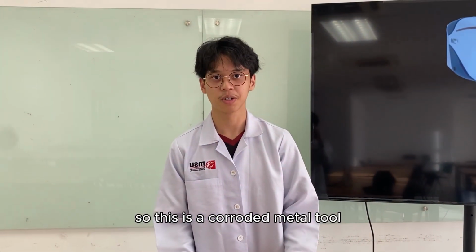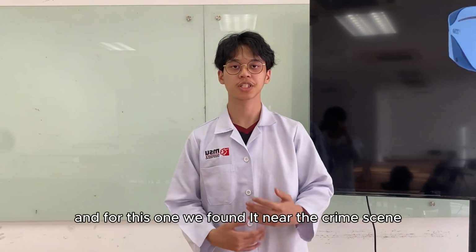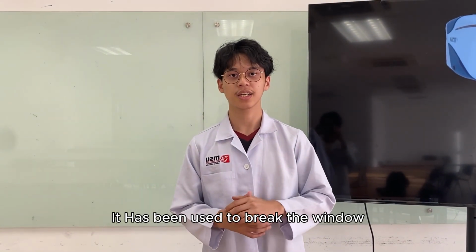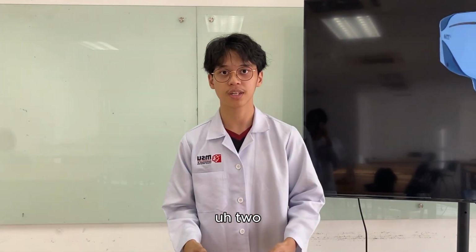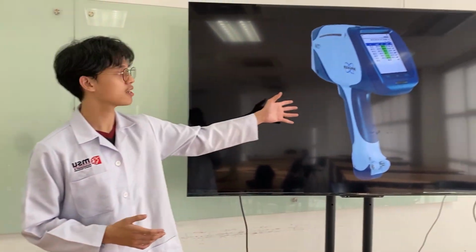So this is a corroded metal tool, also known as a rusted chisel, and for this one we found it near the crime scene, near a window which was broken, and we suspected that it had been used to break the window. And to analyze this tool, we will be using an X-ray fluorescence gun.